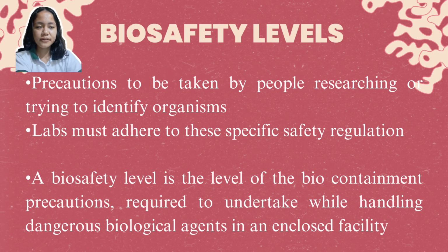So the biosafety levels. Biosafety levels are precautions to be taken by people researching or trying to identify organisms. A biosafety level is the level of the biocontainment precautions required to undertake while handling dangerous biological agents in an enclosed facility. So what is containment?